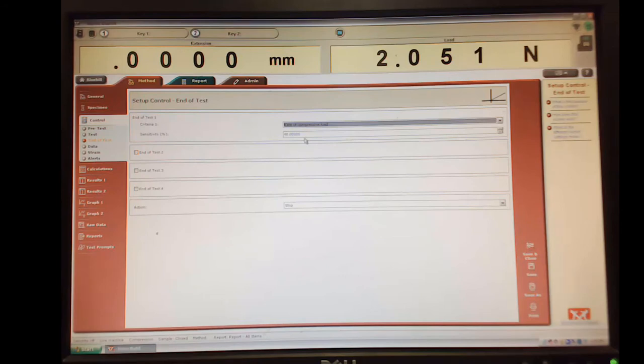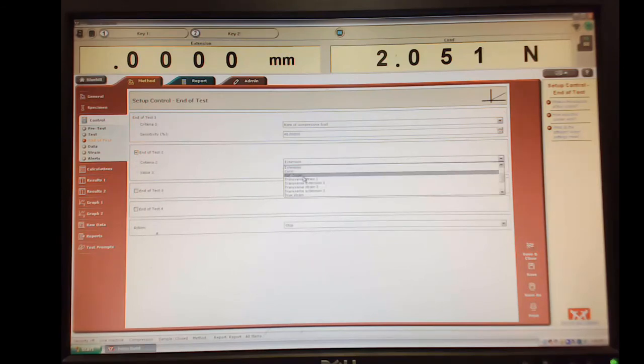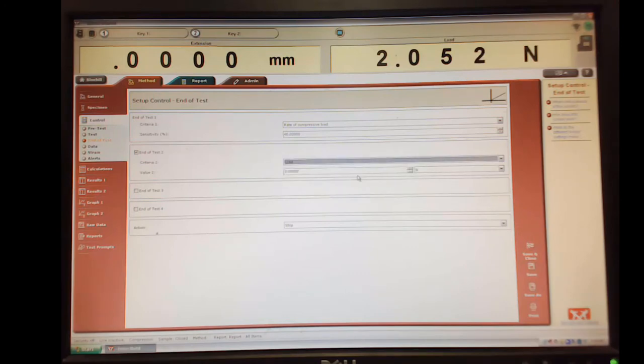Okay, and that's all we're going to do. We're just going to go and press down until we get to the end of the test. So this first one is for braking. I don't think we'll get there, but I'll go ahead and leave it on there. The other criteria we always want to have is our load.